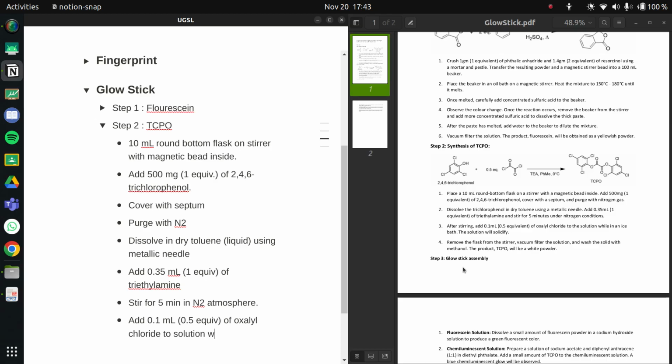Alright, so you should probably write some more stuff. So stir, then you put it in the ice bath. Okay.